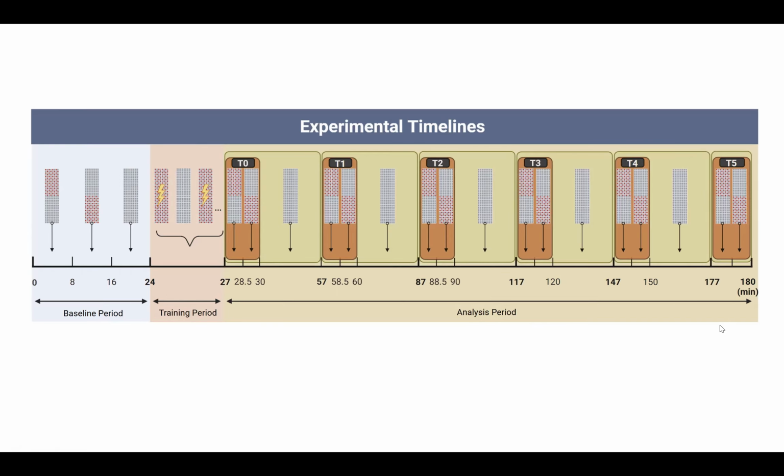Because importing a 3 hours video directly into the tracker can be very slow, and it will just take forever to import the 3 hours video into the software, the first step that you need to do after you got the recording is to cut the full recording into smaller video segments. The main time points that we are interested in are T0, T1, T2, T3, T4, and T5, which are used to evaluate the zebrafish performance after the training.